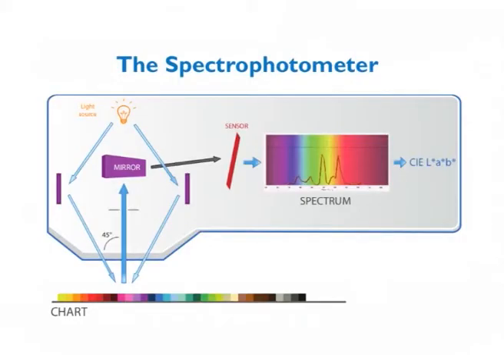Spectrophotometers. The spectrophotometer operates by comparing the amount of light in the beam transmitted through the sample with the reference beam which passes through the reference cell. This gives the amount of light absorbed by a compound at a given wavelength in the UV visible region.